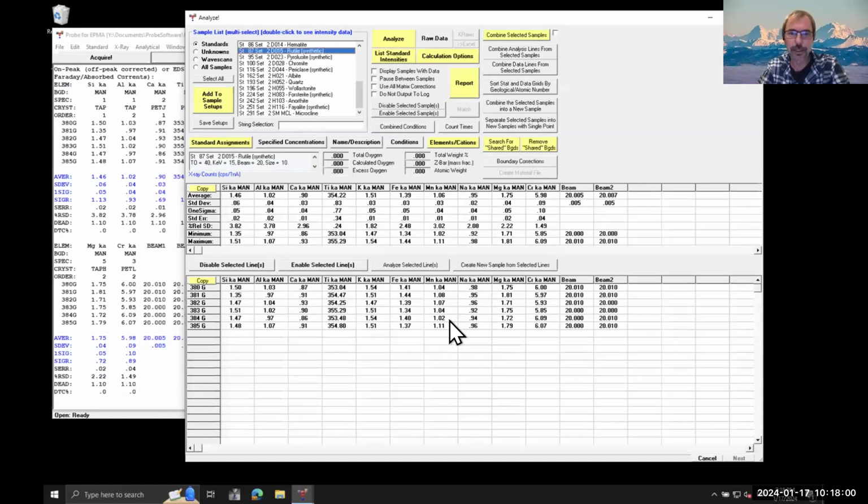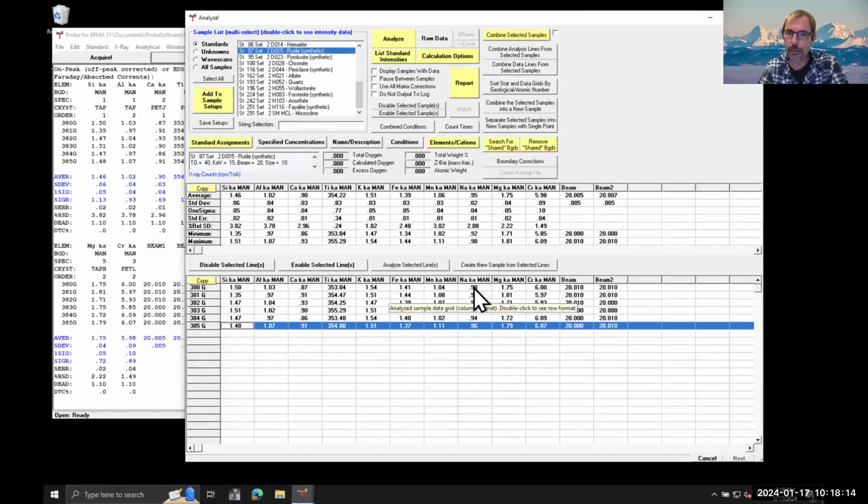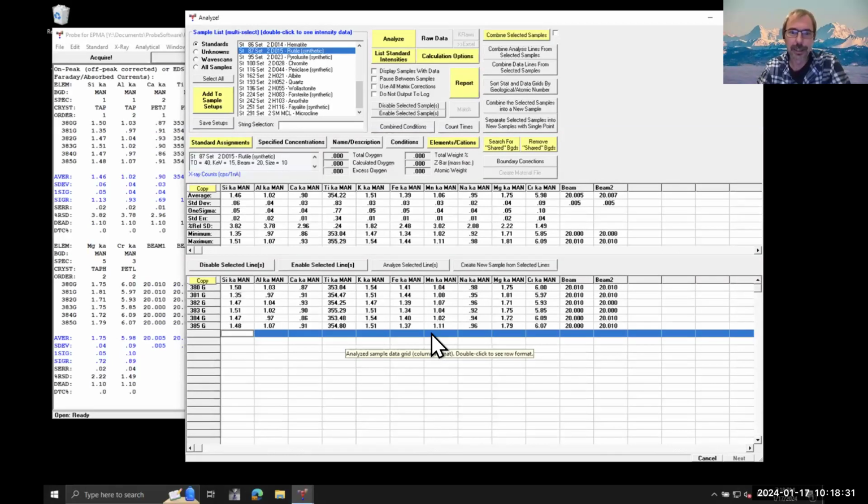And if I consider, for instance, the measurement of the sodium in my rutile, I actually have no sodium in the rutile, and there is no X-ray line interfering with my sodium K alpha. So the measurement that I have here, which again is peak measurement only, corresponds to a measurement of the bremsstrahlung. This is my background intensity in rutile on the sodium K alpha. And the same goes for every element, providing, of course, we do not have the element present.